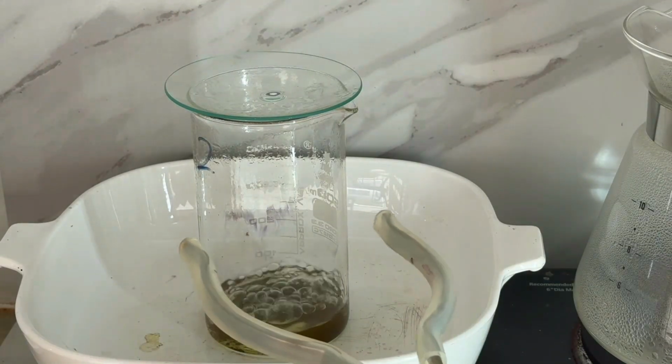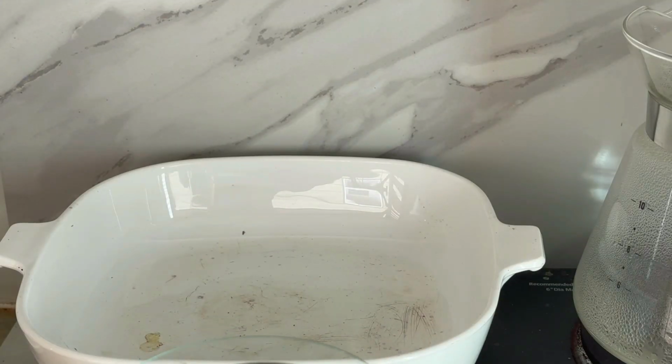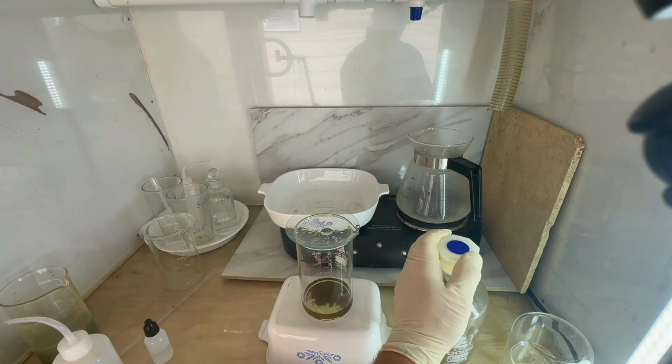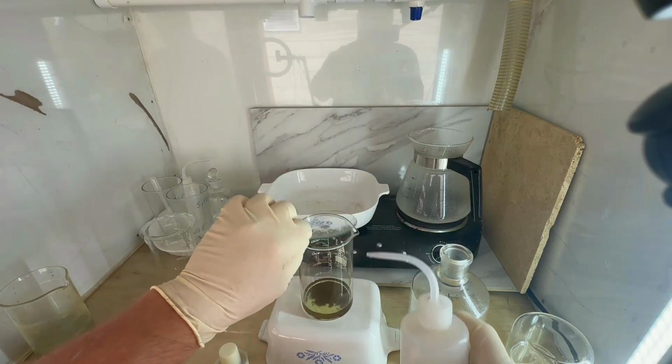I'm going to put this up on the heat, put a cover on it, and let it boil. All right, so we've been boiling for about 10 minutes now. I'm going to go ahead and pull this off, let it settle down a little. Could definitely tell a couple of things with this. One, the gold is clumped up better. And two, because there's color in that hydrochloric after the boil, there were some base metals in there that the hydrochloric acid brought out.